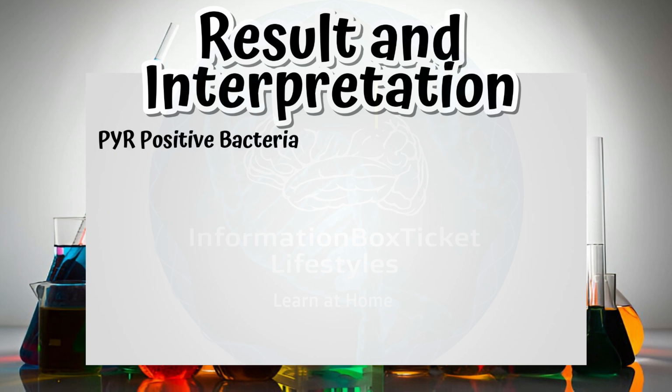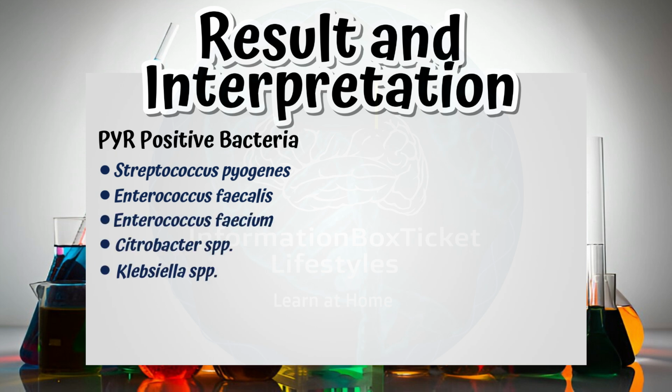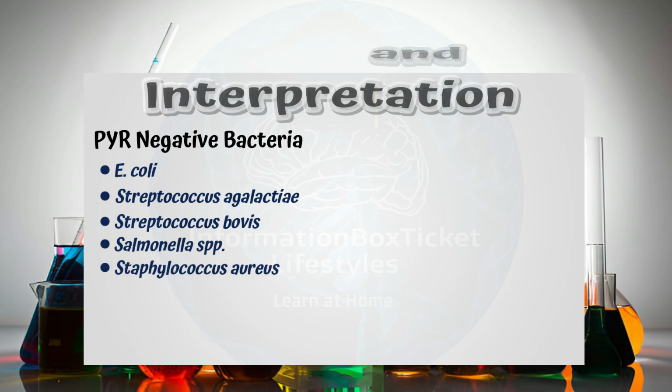PYR positive bacteria: Streptococcus pyogenes, Enterococcus faecalis, Enterococcus faecium, Citrobacter species, Klebsiella species, Yersinia species, Staphylococcus haemolyticus. PYR negative bacteria: E. coli, Streptococcus agalactiae, Streptococcus bovis, Salmonella species, Staphylococcus aureus.